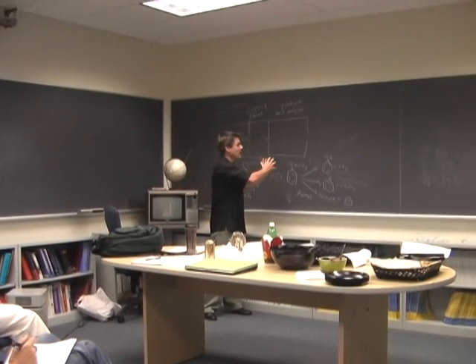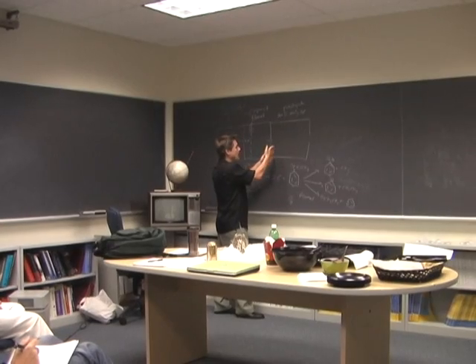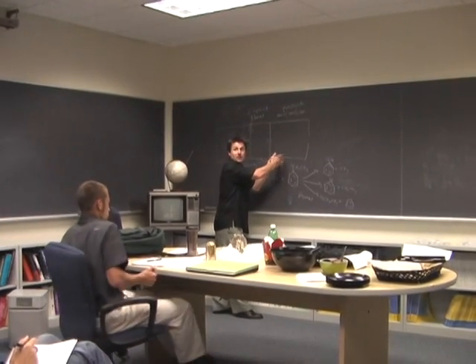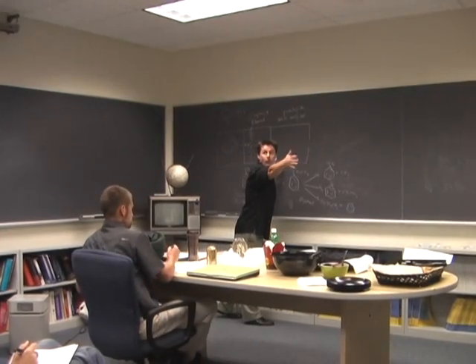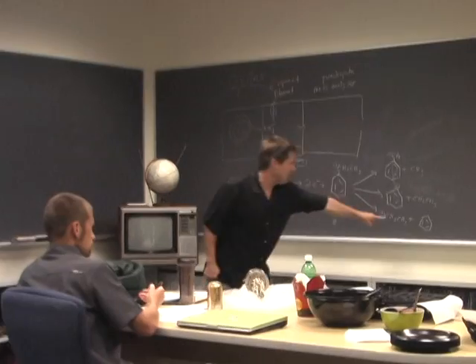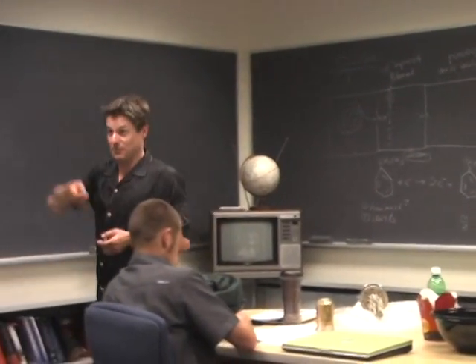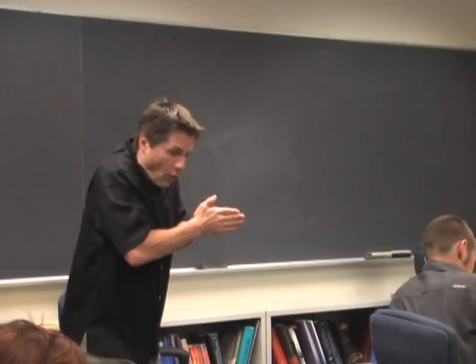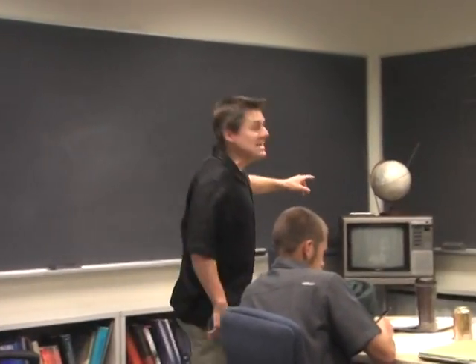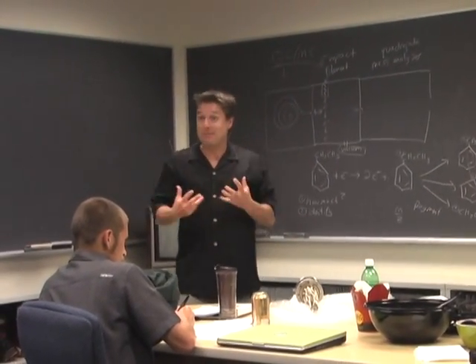We have to be able to filter through and say, okay, let's monitor mass 1. Anything there? Nothing. Mass 2. Anything there? Nothing. Mass 3, mass 4, all the way through to mass 100 or 200. And measure each one, we would get a peak here, here, here, and here. Boop! At that mass, we got a peak. We got a bunch of ions coming through. So we need to scan through all the mass to charge ratios in milliseconds before species B comes off the column. It's really amazing how they do this.